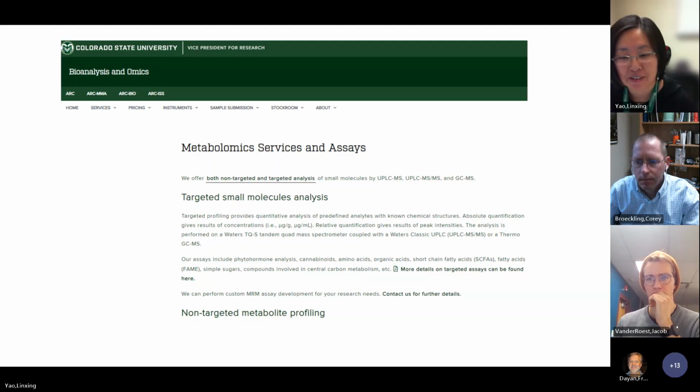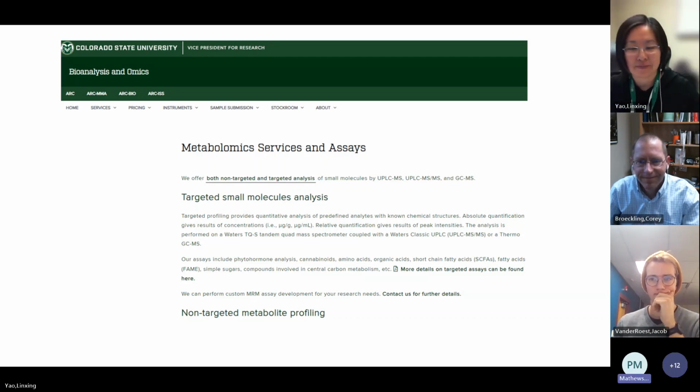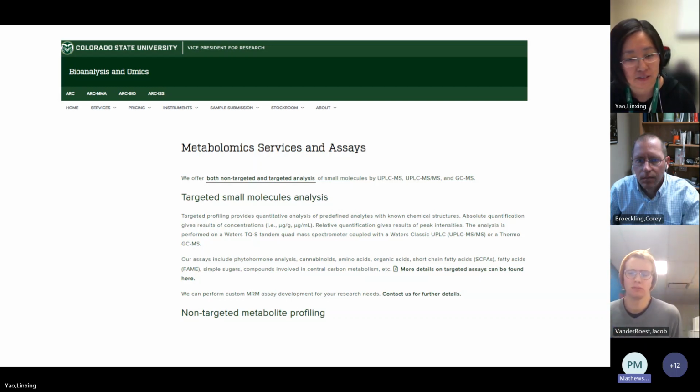Hi, Linxing. Thank you for the talk. It was very informative. I was curious about the example about different steroid hormones and estradiol, how it seemed like optimizing both signals actually utilized different chemistries. Like the formic acid was the best additive for the estradiol, but the ammonium fluoride for the others. So how do you deal with those kinds of problems when you have different conditions in the same run that are more optimal?